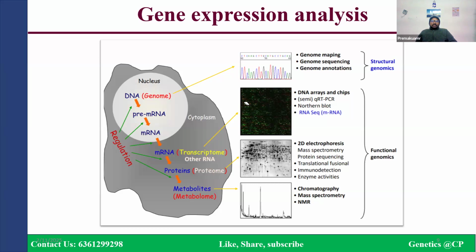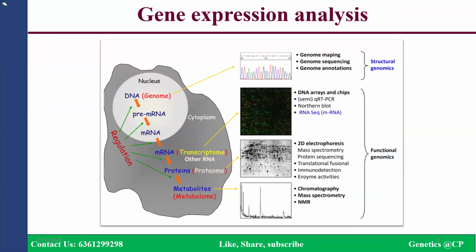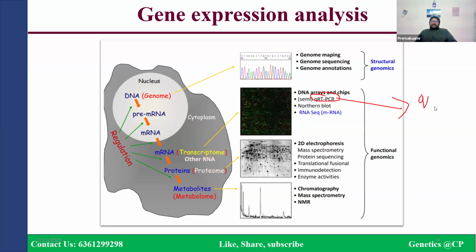There are different technologies, and today we are going to deal only with RNA-seq, and I will also give some idea about qRT-PCR. What is qRT-PCR? Quantitative real-time PCR. During corona time it was a very famous technology, quantitative real-time PCR.